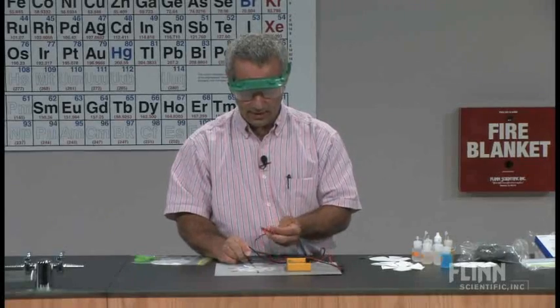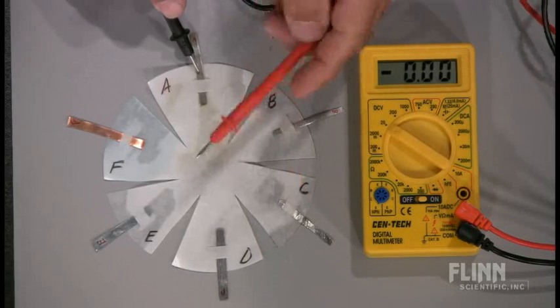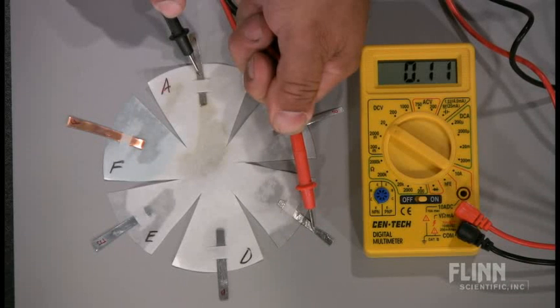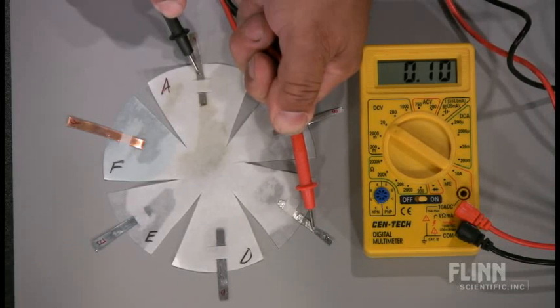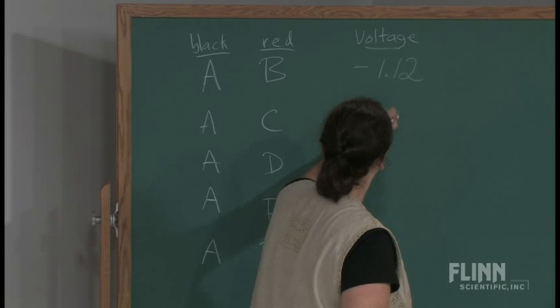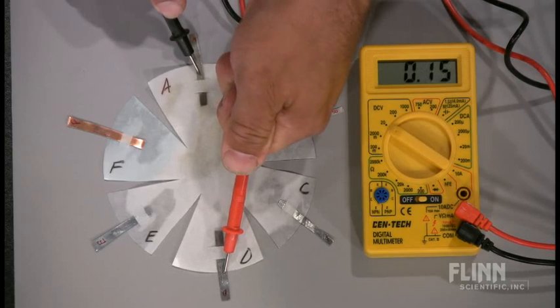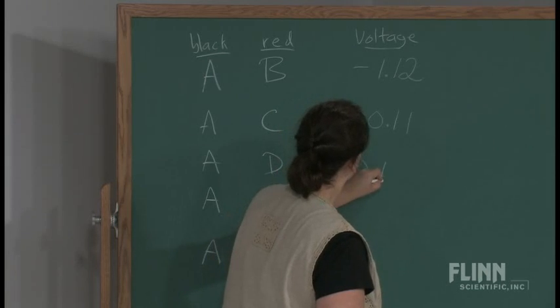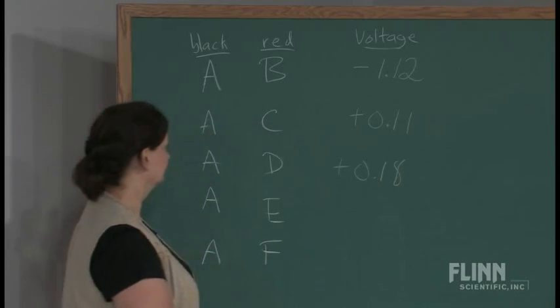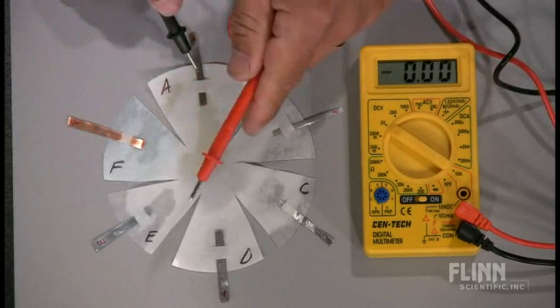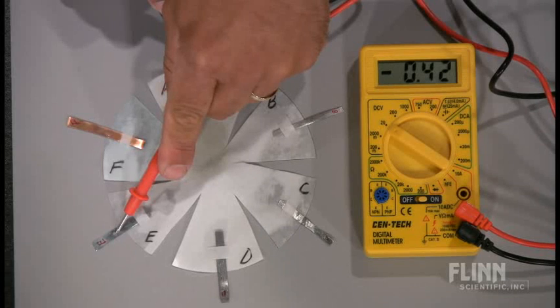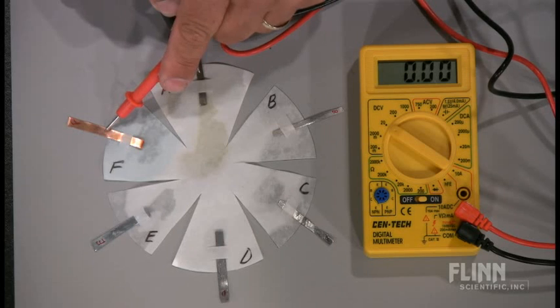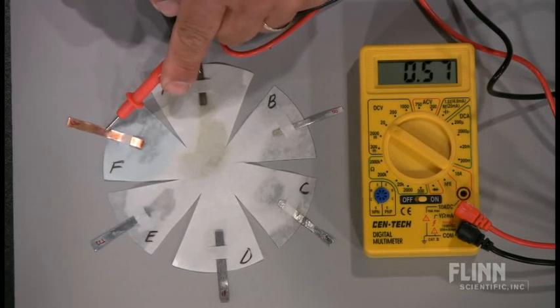A and C. I'm always going to keep the black one on A, so we're consistent. I'm trying not to get in the way of the voltmeter there. Positive this time, 0.11. It's kind of fluctuating between 1.1 and 1.0. A, D, positive 0.18. So in this situation, the electrons are flowing from A to D, but with not a strong force. A, E, negative now, 0.42. And A, F, a positive 0.57.